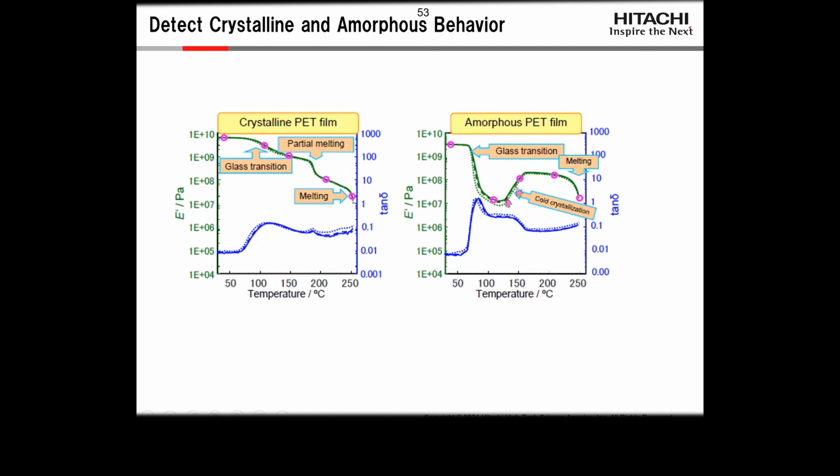In PET and in silicone rubbers, after you go through the glass transition, the material can rearrange and you can get an actual increase in modulus where the material forms more crystals in the run. While you can pick this up in the DSC, you can only pick up the temperature change. You can't see what kind of change this makes in your modulus behavior. In PET it doesn't make that big a difference, but some of the silicone rubbers are actually stronger after the cold crystallization than they were before.